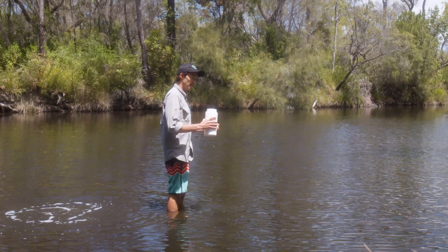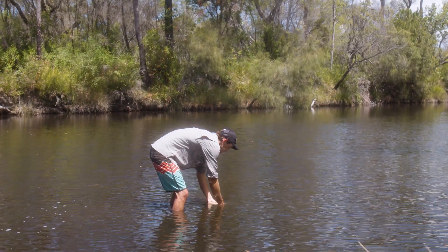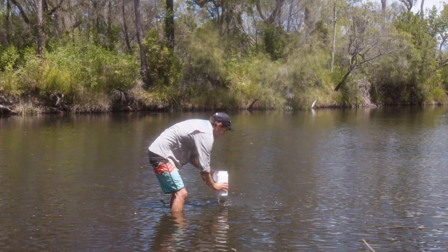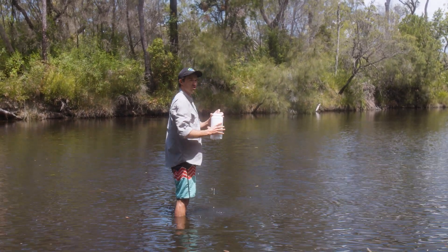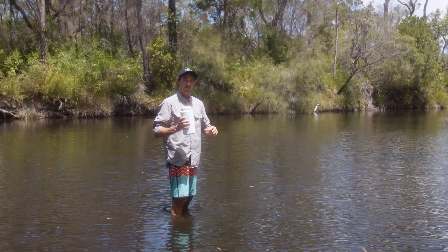When we're actually taking our final sample, place the container upside down, push down to a depth of about 20 centimetres, then turn your sample jar sideways, bring it up and screw on the cap. If the water is too shallow and 20 centimetres deep is going to disturb the sediment, just take it to a depth of about one third of the total water depth.